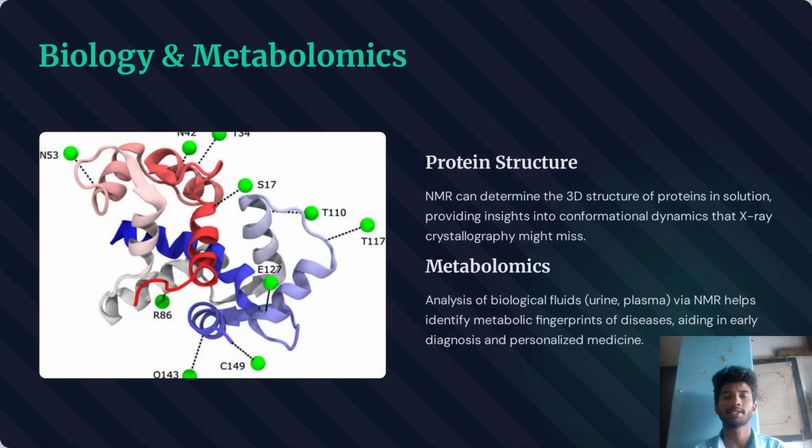Biology and metabolomics. Protein structure. NMR can determine the 3D structure of proteins in solution, providing insights into conformational dynamics that X-ray crystallography might miss. Metabolomics. Analysis of biological fluids, urine and plasma, via NMR helps identify metabolic fingerprints of diseases, aiding in early diagnosis and personalized medicine.